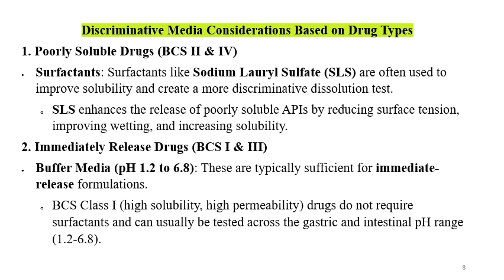Discriminative media considerations based on the drug types. So poorly soluble drugs may be there, and these may be formulated in immediate release or sustained release. Then some soluble drugs may be there. So based on the solubility of the APIs and formulations, the discriminative media should be considered. For poorly soluble drugs, surfactants like SLS can be used, and then the SLS concentration is required to be optimized for getting the discriminatory dissolution media.